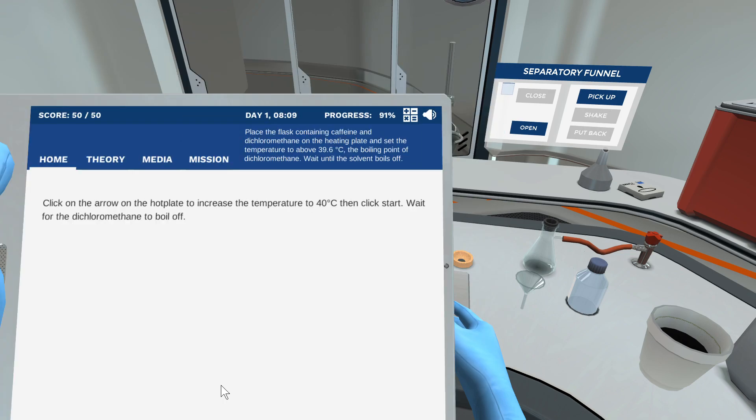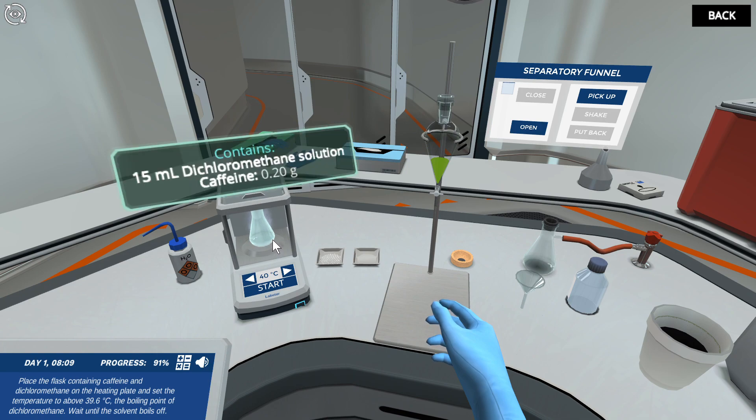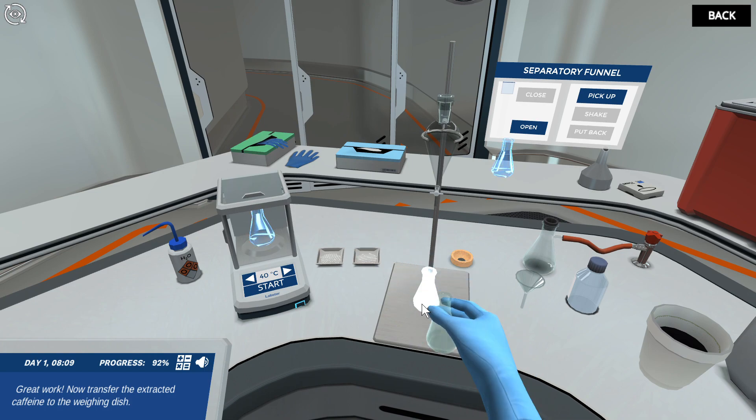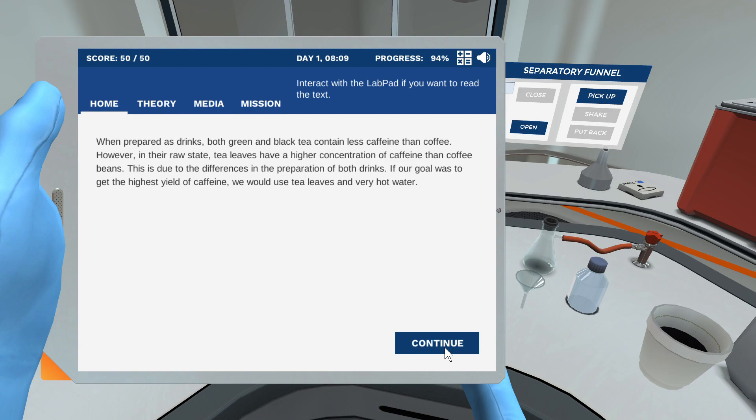Place the flask containing caffeine and dichloromethane on the heating plate and set the temperature to above 39.6 degrees Celsius, the boiling point of dichloromethane. Wait until the solvent boils off. Great work! Now transfer the extracted caffeine to the weighing dish. Hover your cursor over the weighing dish to read the results.